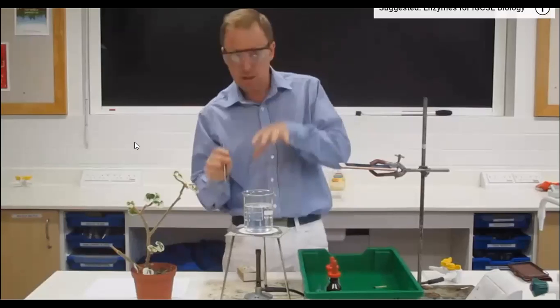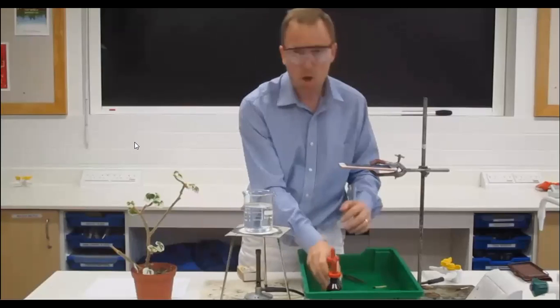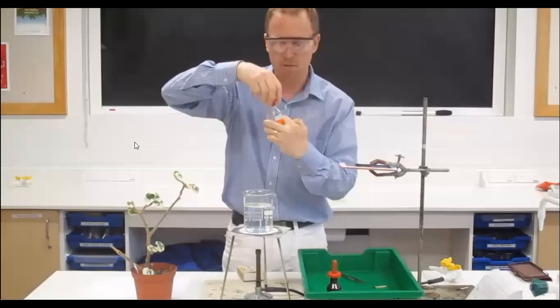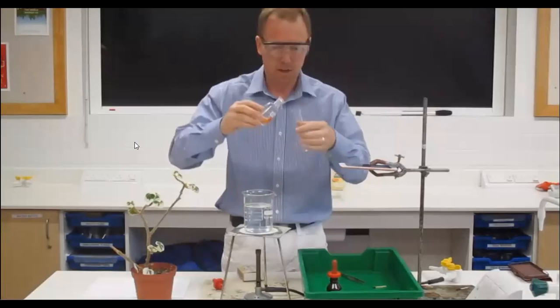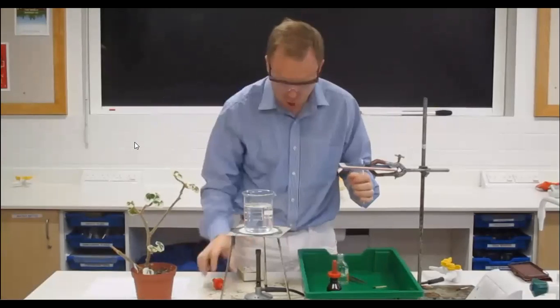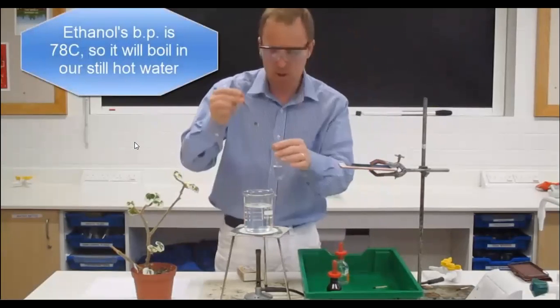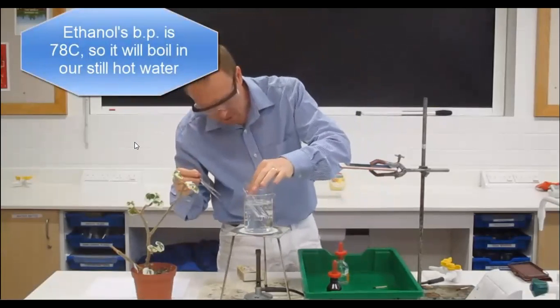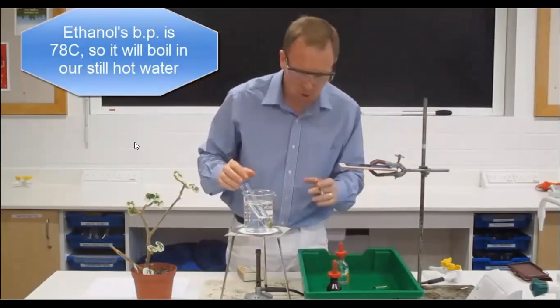Now importantly, we've switched off our flame because now what we want to do is submerge our leaf in boiling ethanol. Ethanol, of course, is extremely flammable, and so we don't want any naked flames near it. And we'll boil the ethanol by putting it into our water bath here. So out you come, Mr. Variegated Leaf, pop you in there, and we're going to leave that in there boiling for about 2 minutes.